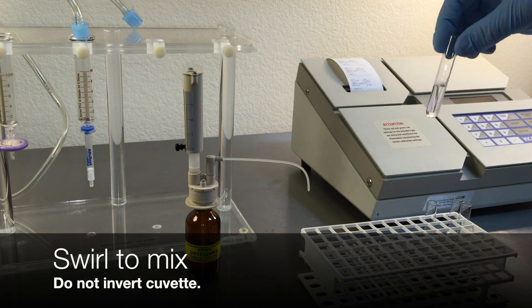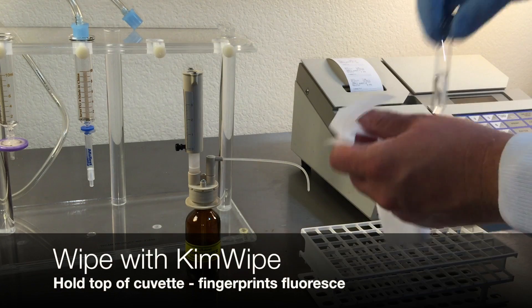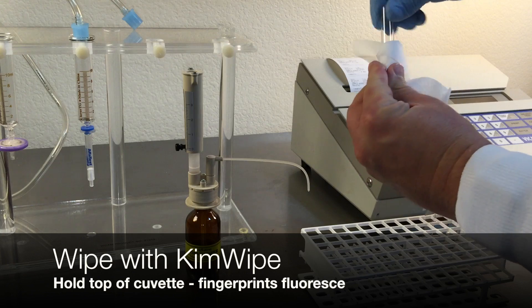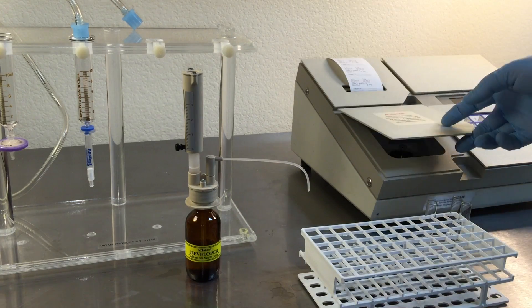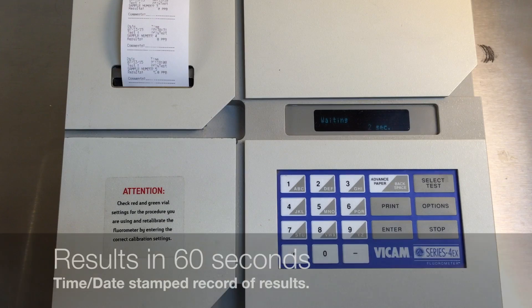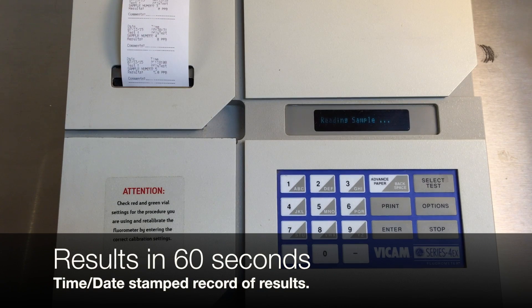Do not invert the cuvette. Wipe with a Kim wipe — remember, fingerprints can fluoresce. Insert into the calibrated fluorometer. This is a time-sensitive step. In 60 seconds, you will receive a time-date stamped record of your results.